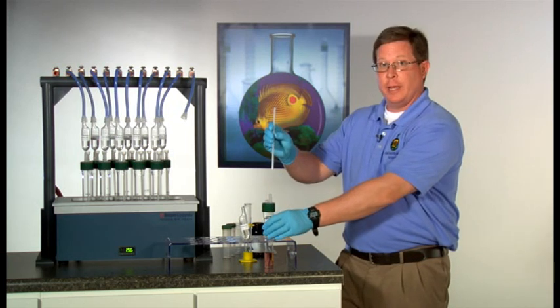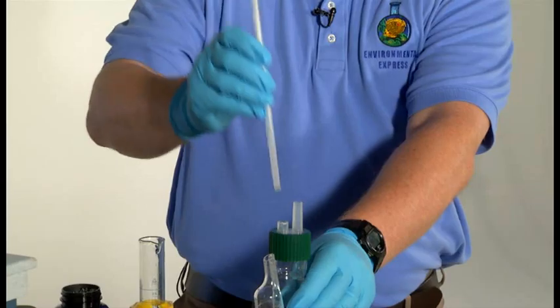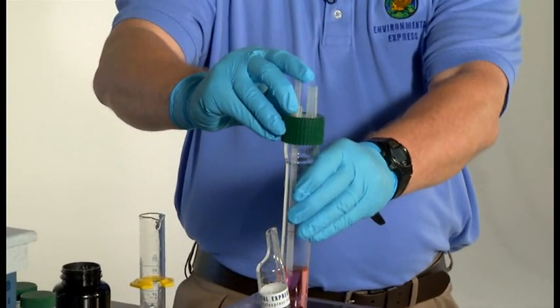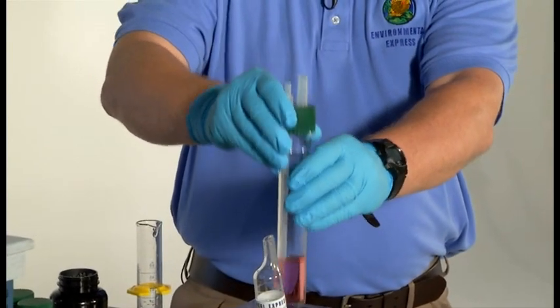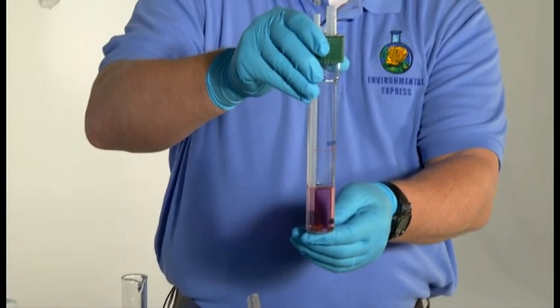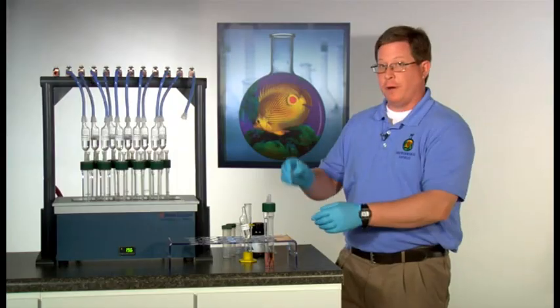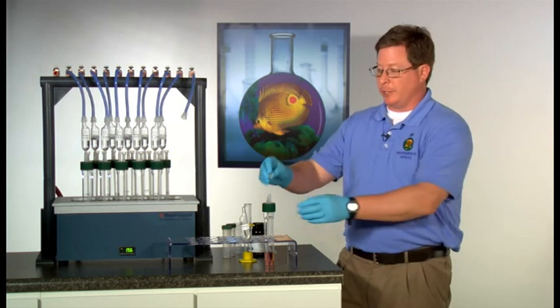A reagent addition tube is then added to the shorter of the two ports in the two-port cap. It's important that the bottom of the reagent addition tube is below the surface of the sample. The funnel is then placed on top of the reagent addition tube.